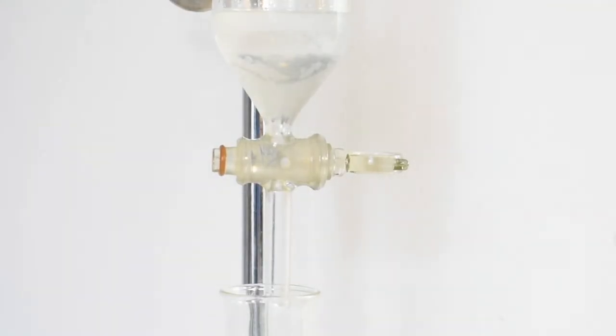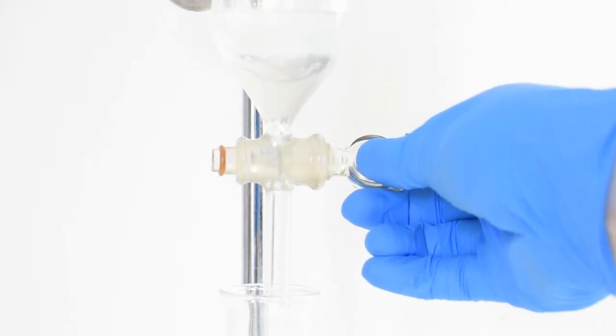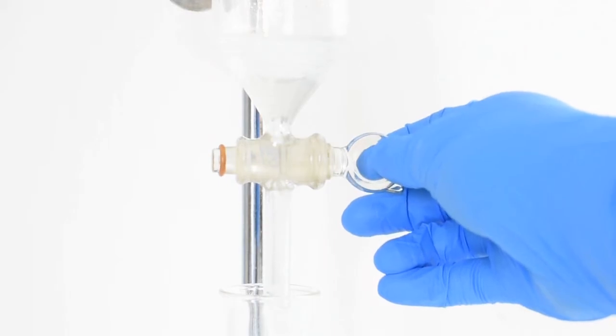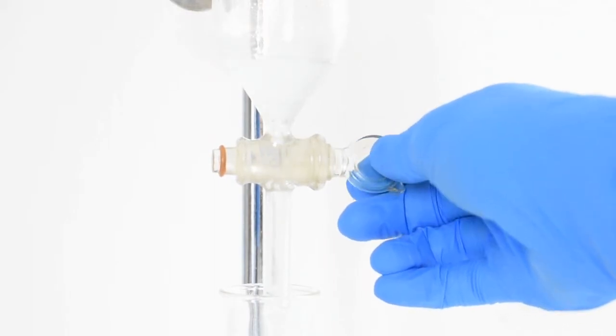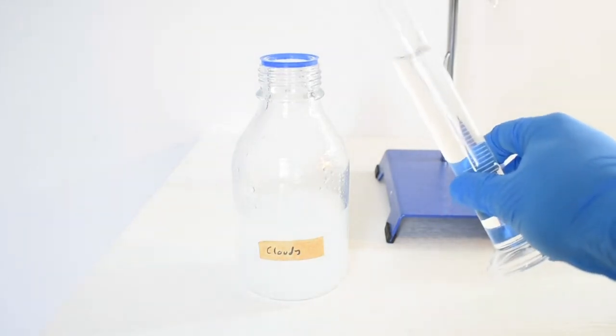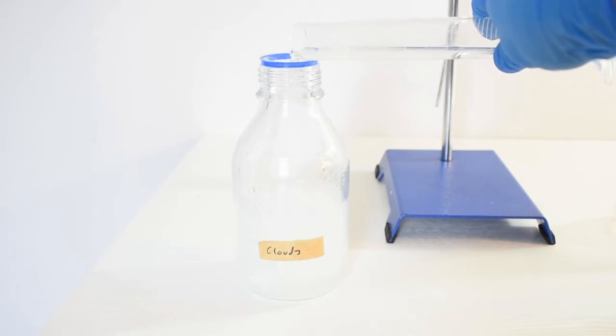From the separatory funnel, the lower dichloromethane layer is drained into a conical flask, while the upper aqueous layer will be returned back to the bottle. Another 50 milliliters of dichloromethane is added to the bottle and the washing step is repeated.